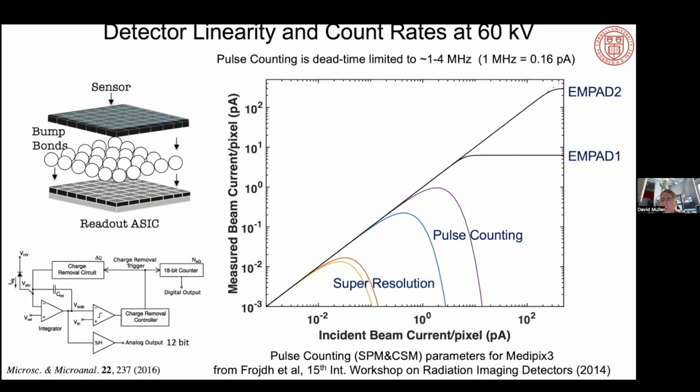I should mention that these hybrid detectors are also very good for XFELs, because all the electrons arrive in a single bunch, but they actually take a little while to get out through the silicon. So if you send an XFEL bunch, I get to read out in maybe a couple of cycles because some of it comes out slowly. And so you can have several hundred electrons in a pulse, say a femtosecond pulse, and you can record it without saturation. So it works very nicely for a diffraction pattern and the central beam from an ultrafast source.